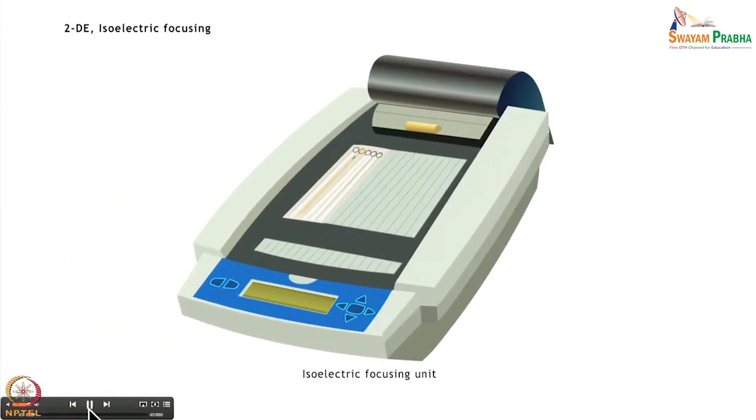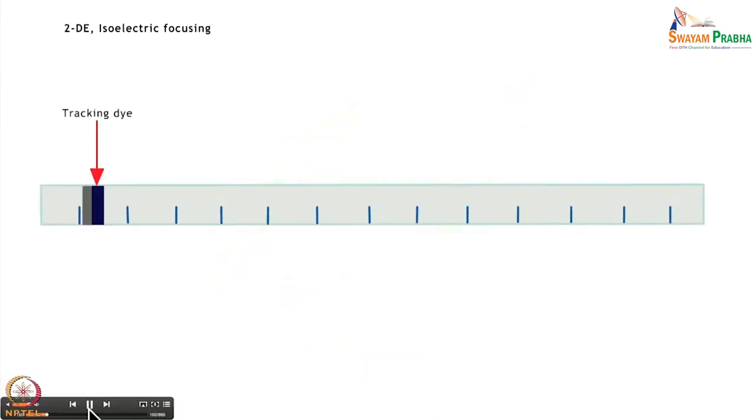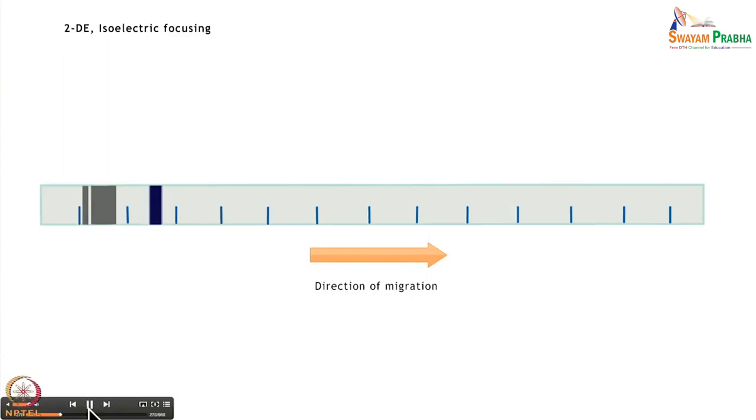These loaded strips are then focused on an isoelectric focusing unit by passing current. The various proteins of the sample mixture migrate in the electric field and come to rest when the pH is equal to their pI, that is, they become neutral and are no longer affected by the electric field. Progress of electrophoresis is monitored by means of a tracking dye like bromophenol blue, BPB, which is a small molecule and therefore migrates ahead of all other proteins.